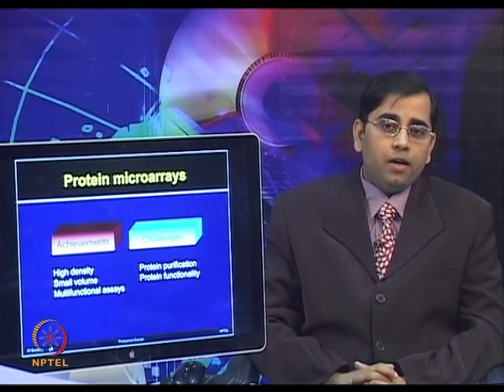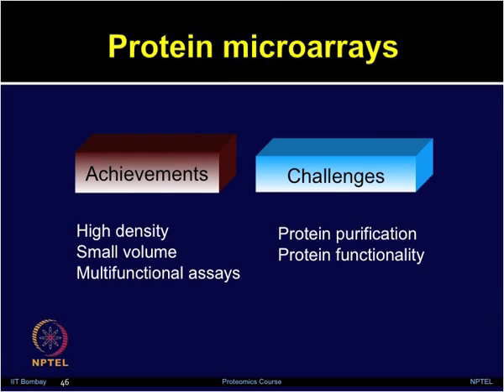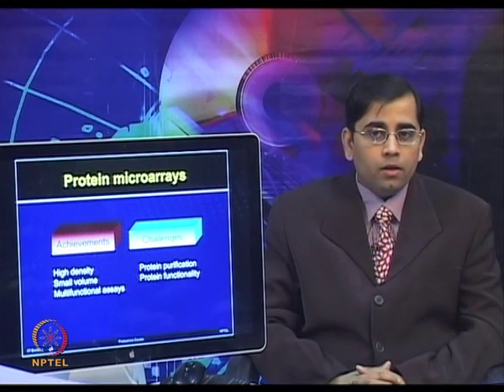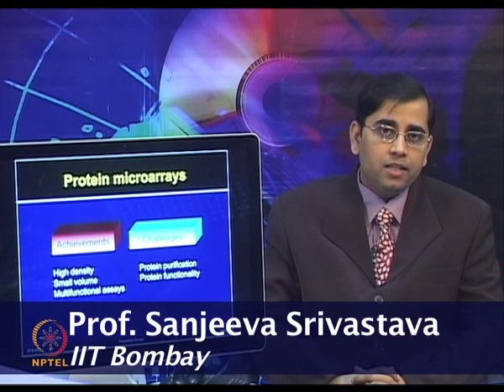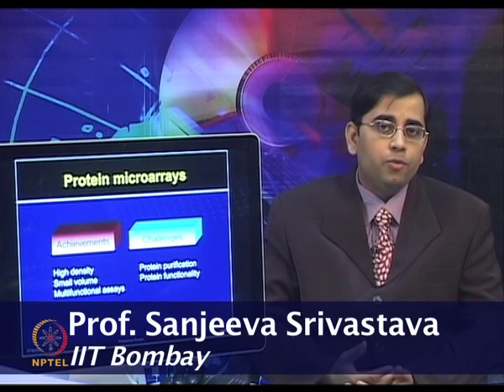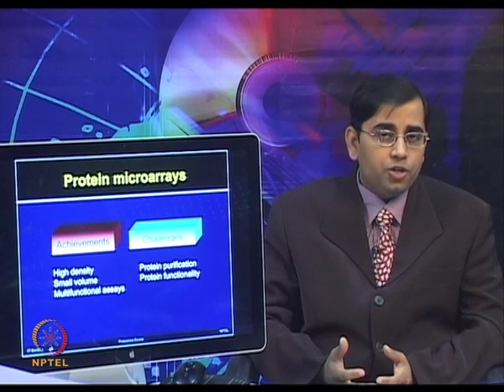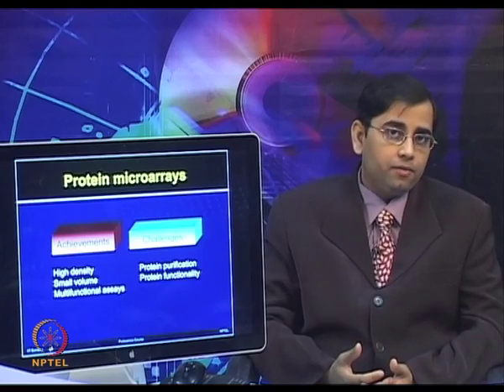Protein microarrays have provided a high density, high throughput platform, which is one of the major achievements of this technology. Very small volumes of clinical samples, biological samples or pharmaceutical samples can be used on these array surfaces and multifunctional assays can be performed. However, there are still various limitations and challenges of using protein microarrays, which include generating the protein content, its purification, as well as keeping it functional and stable on the shelf, that is, its shelf life.